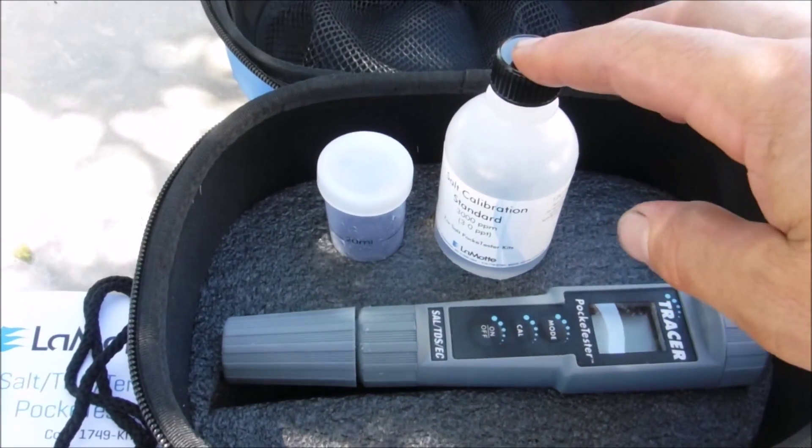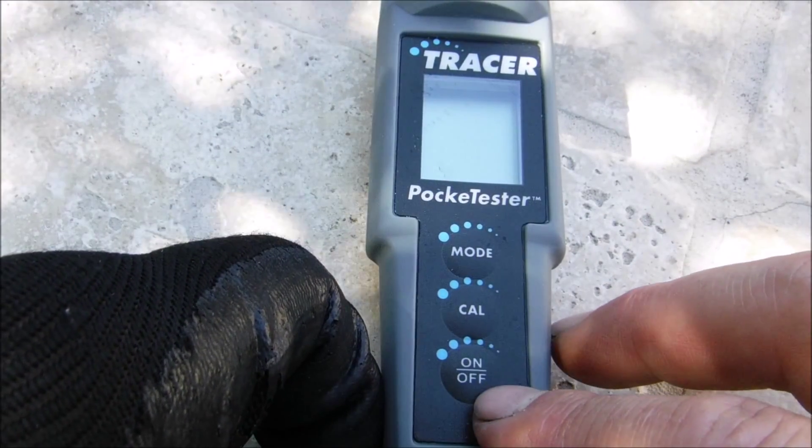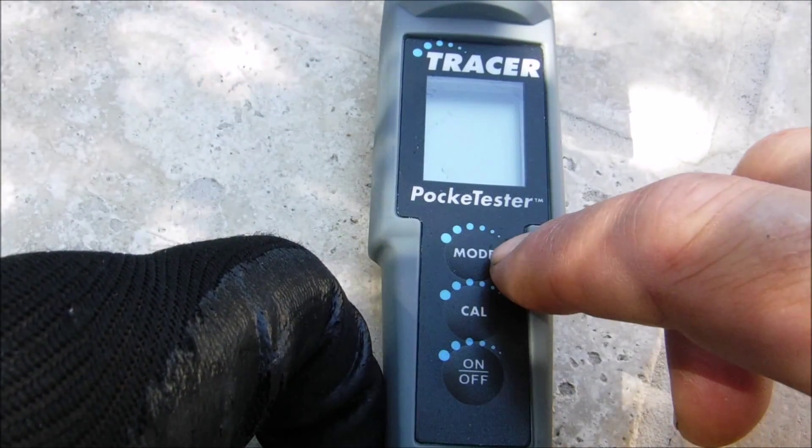Included with the Tracer is a salt calibration standard. You also have the sample bottle, and the Tracer itself has three buttons: there's an on-off, a calibration button, and a mode button.